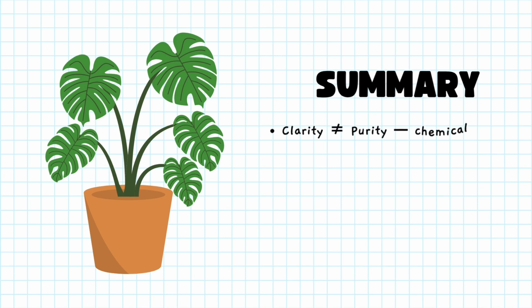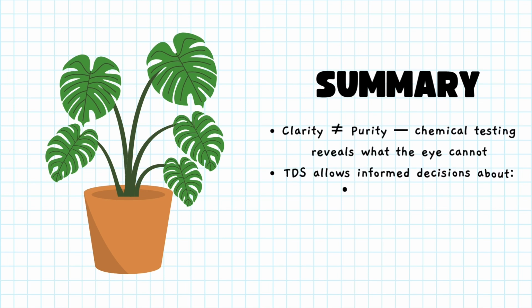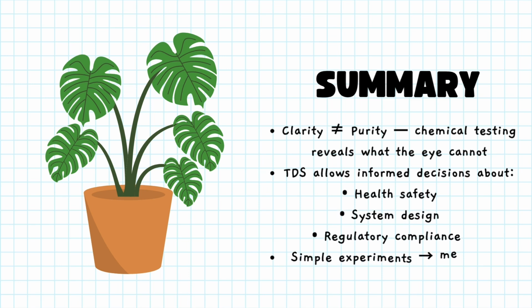TDS gives us a quantifiable handle on water purity, and with just a meter, a heat source, and a little curiosity, anyone can start analyzing what's in their own supply. Don't forget, clarity does not equal purity. Chemical testing reveals what the eye cannot.